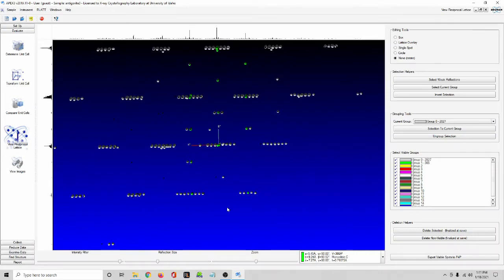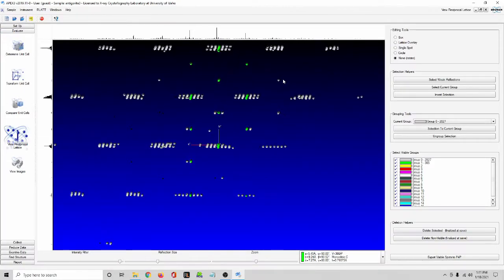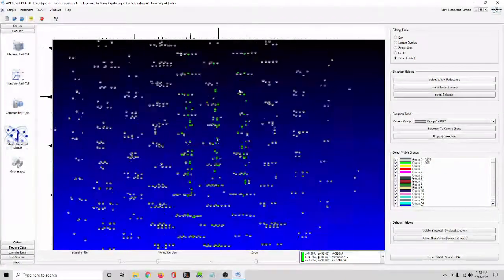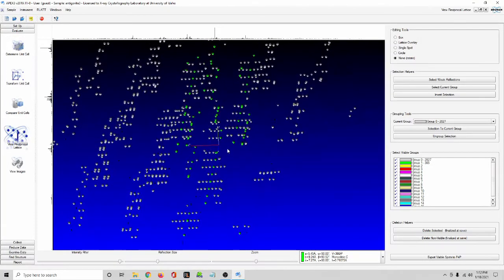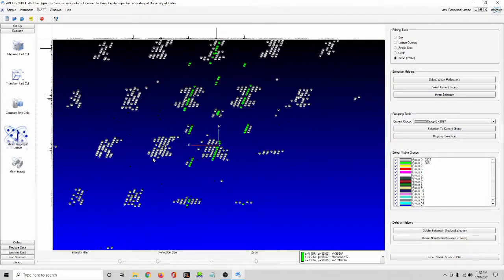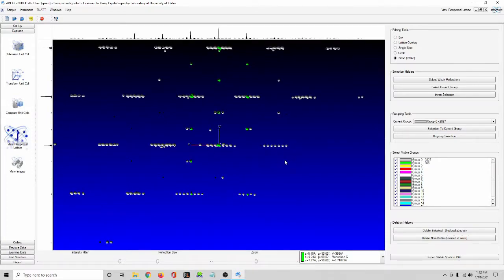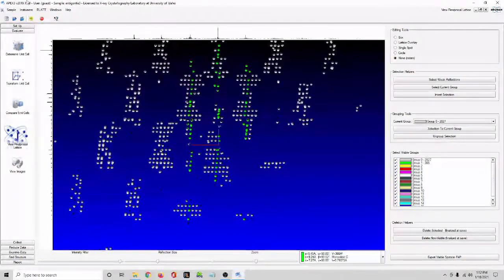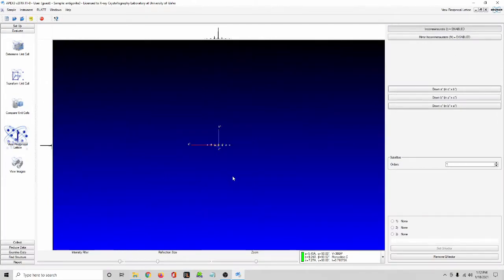We don't have all of the sublattice because we're missing these rows and everything, but there's a shortcut for that, because we know now that the modulation, the direction of these satellite peaks, is roughly along A star, apparently, because that's where the close spaced peaks are. We have a modulation in that direction, and that should be it. We can go to RLAT and incommensurate mode, and we can enable incommensurate mode.